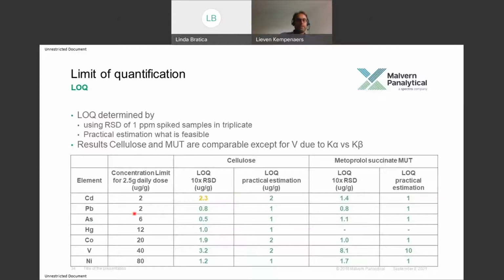And I just want to point out that for the big 7 elements, within the 30 minutes, they achieve all the values, or at least the limits of quantification, except for cadmium, which is on the edge, and that can also be changed by increasing the measurement time to 45 minutes, and then it's already solved.